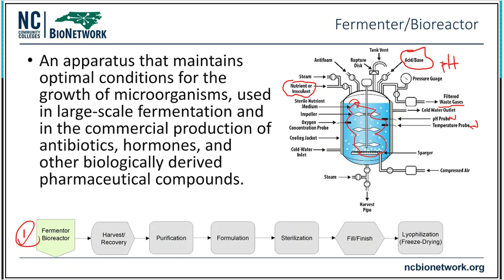We get a sparger. A sparger just bubbles some air in. So maybe that sparger is going to give us some dissolved oxygen that needs to go into that vat, or some type of gas that we need to introduce into the vat in some form or fashion.